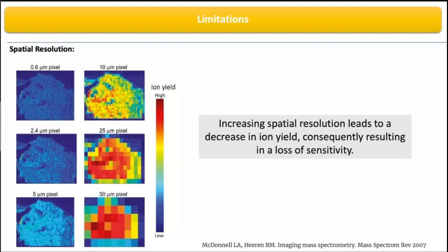Nowadays, different manufacturers have developed or have put in a second laser, or other people have modified the laser, in order to have this good compromise between the spatial resolution and the sensitivity of your method.